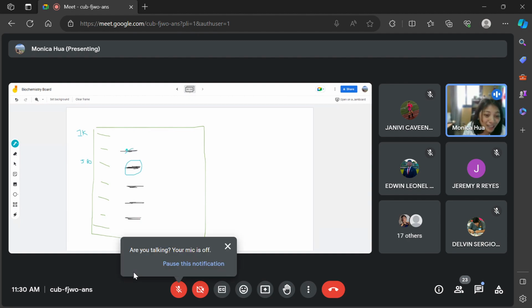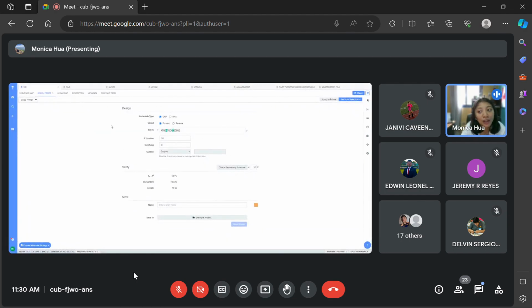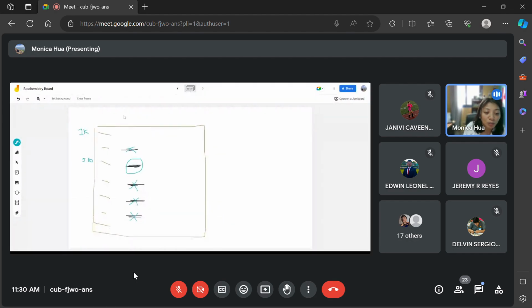But we don't like it when we have all of this other byproduct of PCR. So one of the things to ensure that doesn't happen is to make sure that the primer has almost perfect parameters, right? So that's why we check the annealing, we check the GC content, and we also check the length, okay? So you don't have to start over. It just makes it a lot more clear and precise. Yes. It makes it more precise and you don't have to do a whole other cleanup work, as we call it.